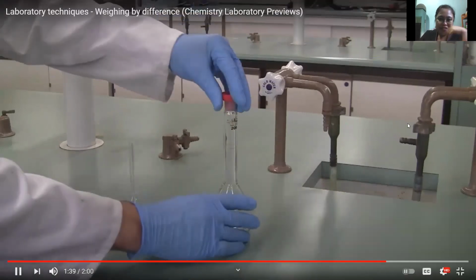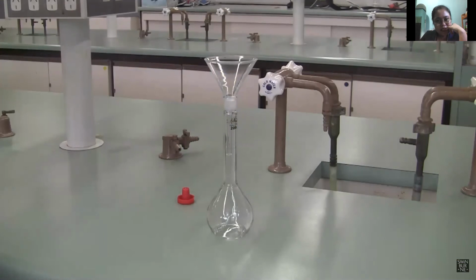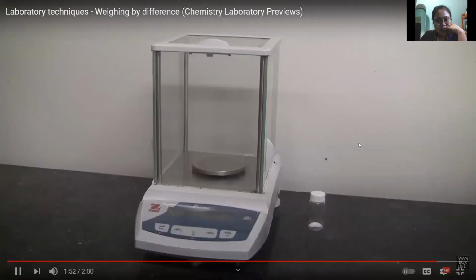If you need to transfer the mass into a standard flask or something with a narrower neck, you can use a glass funnel and transfer into this instead, and then afterwards use your wash bottle or solvent to rinse all of the solid into the flask and make sure it all gets into the receptacle. Right, that's the basics that you need in order to be able to weigh by difference. Good luck.